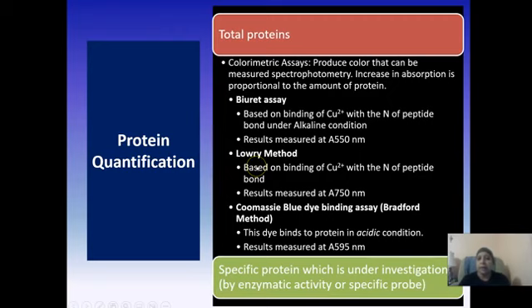There is a newer method that is a new way of using the copper ions called the BCA assay, and that only takes about 30 minutes, and that's very quantitative. It's within the time range, so that's another way that we can look at our stuff. A lot of times in research labs, that's the method that we use. However, sometimes we really need something quick and simple and be able to move on to the next step very, very quickly. Maybe because we want to protect the enzymatic activity of our protein, or we are in a time crunch and need to go to the next step quick.